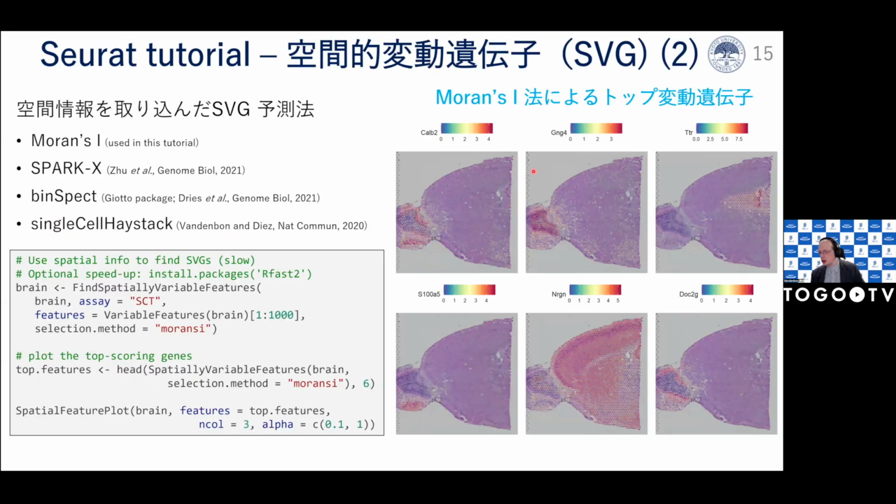So it's here, right? So the question is, is the Moran's I used in slide number 15 a global Moran's I? I would like to analyze the data using other spatial statistics methods with geospatial data analysis too. So how can I obtain such information, such as the coordinate data for Visium spot IDs and the notation rule for the coordinates? Okay, this is not so easy to answer.